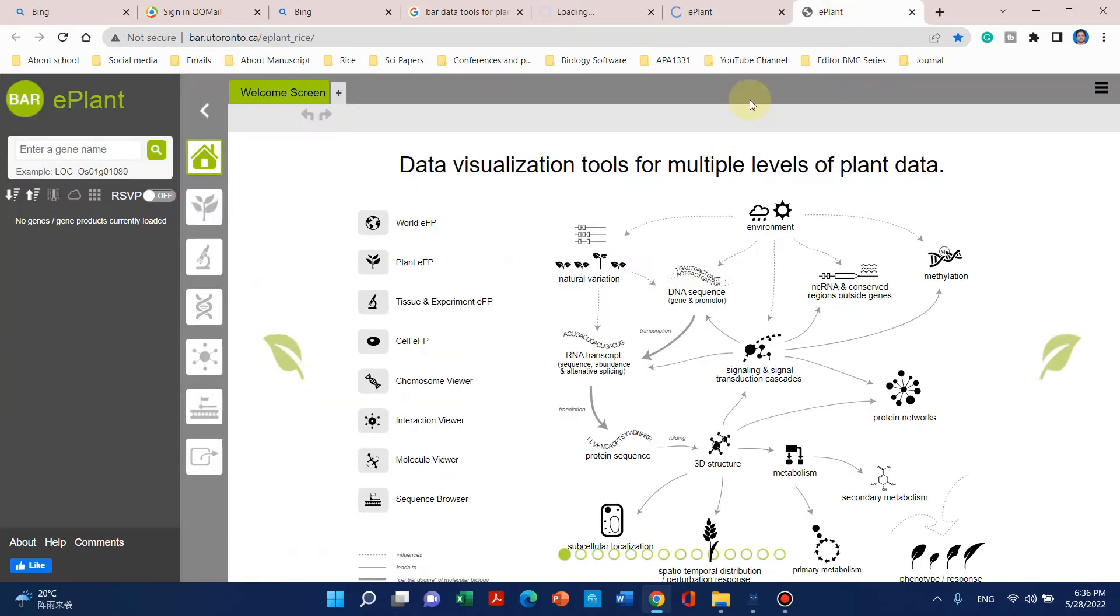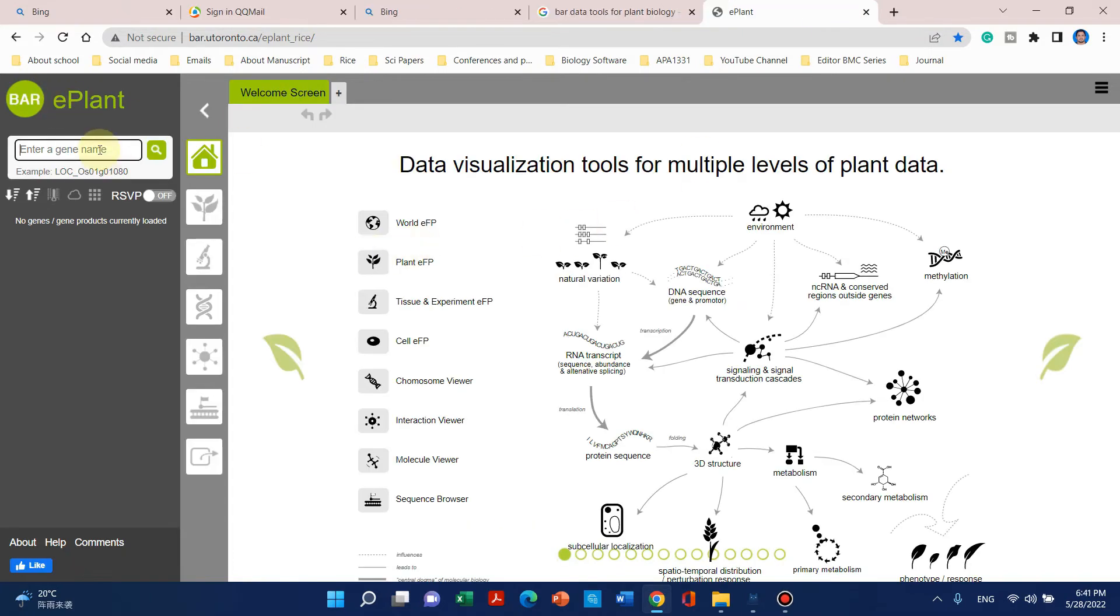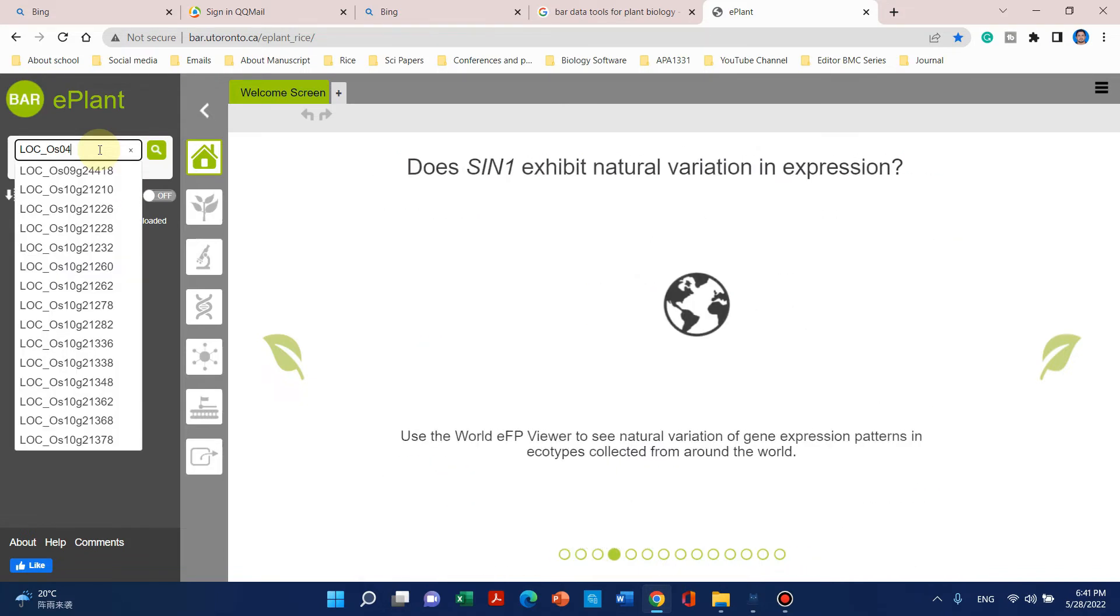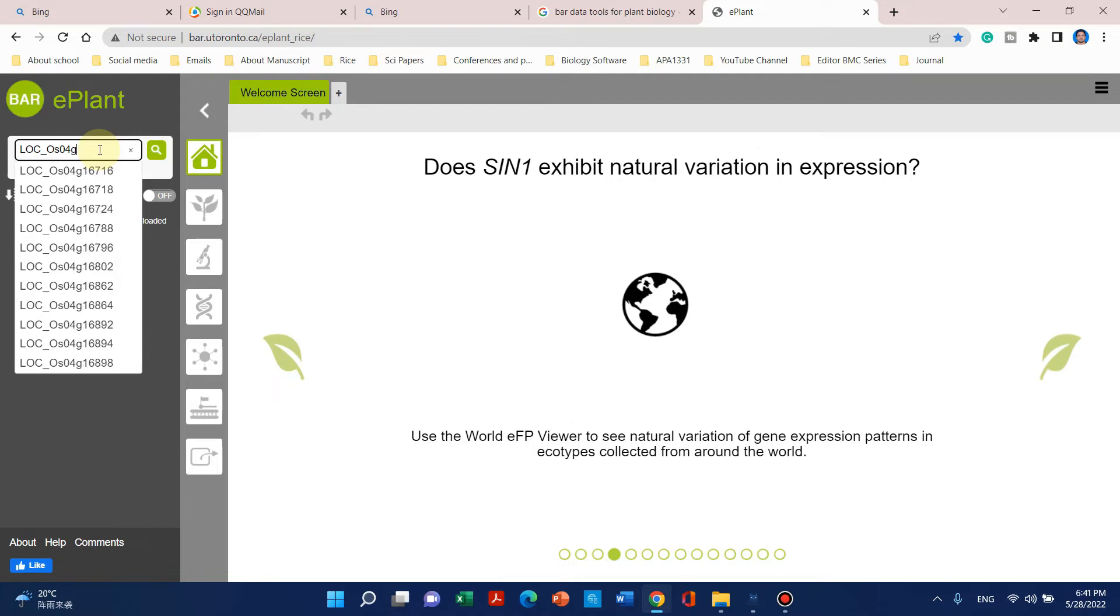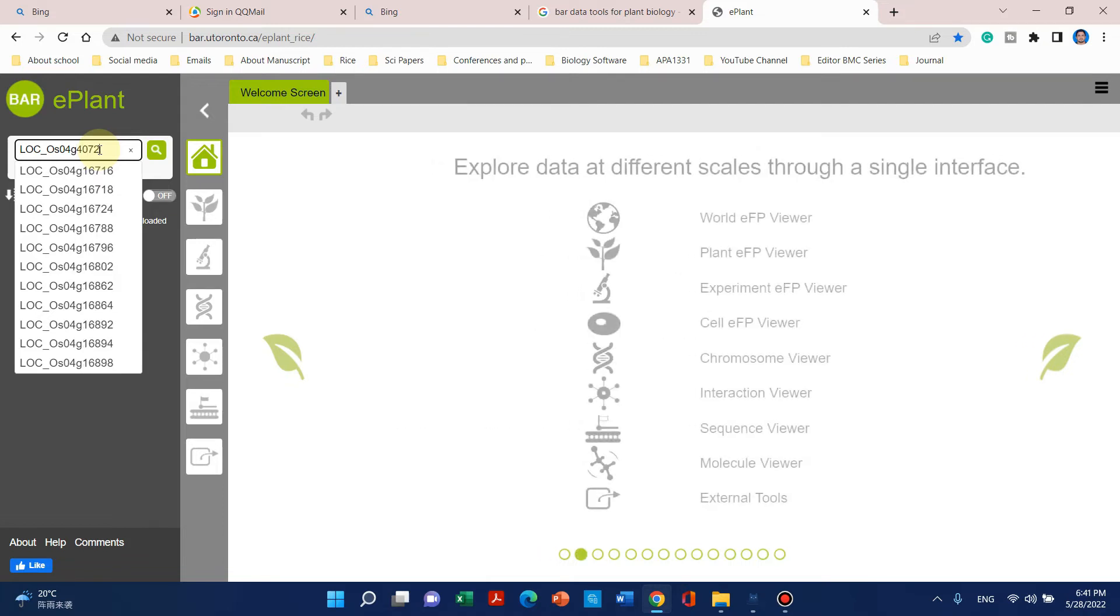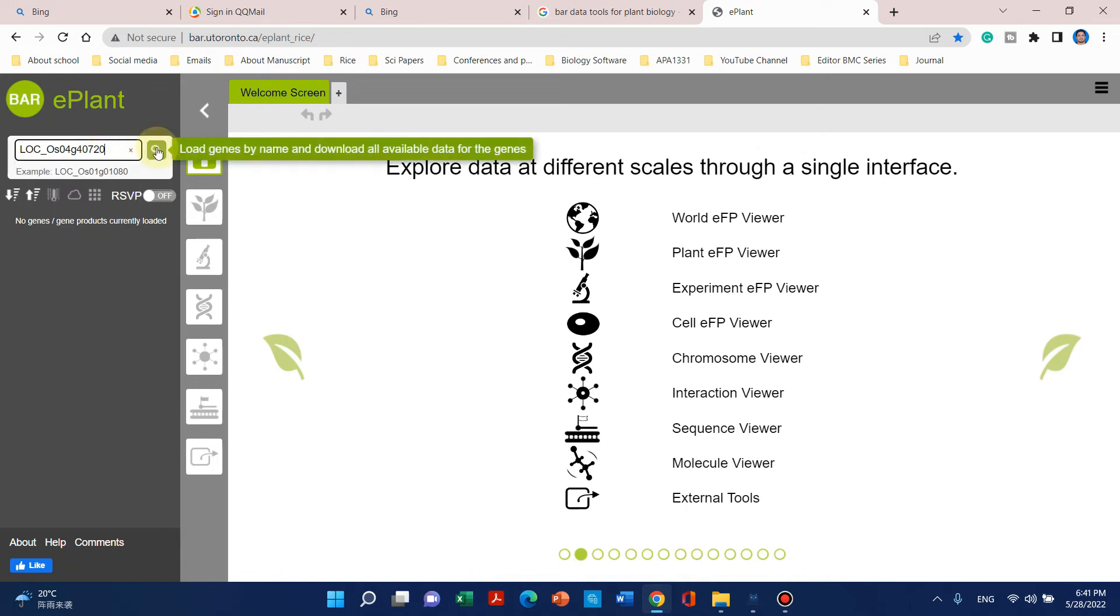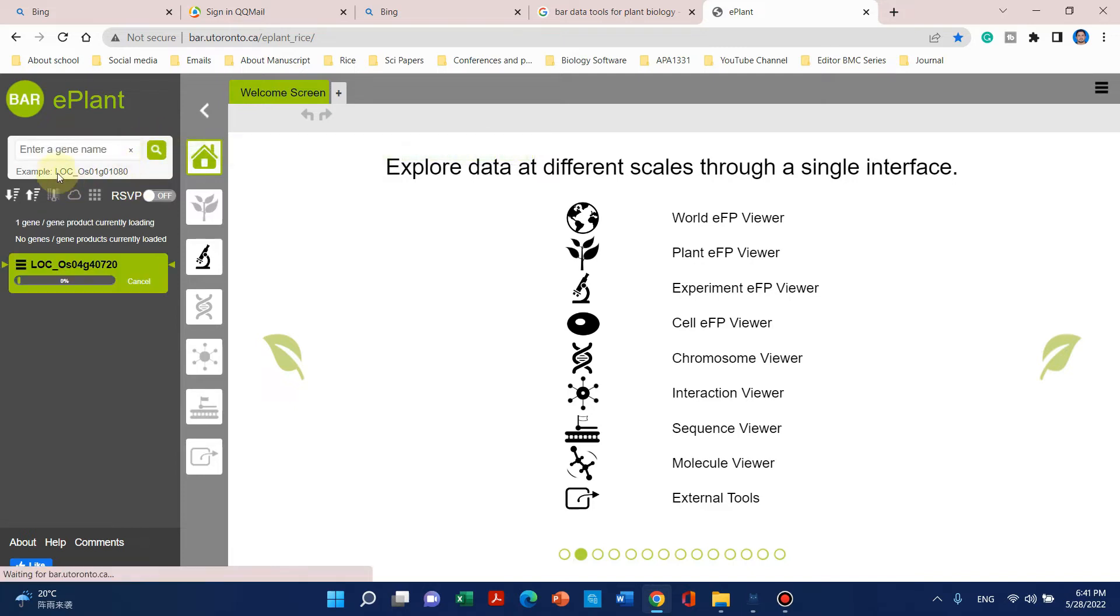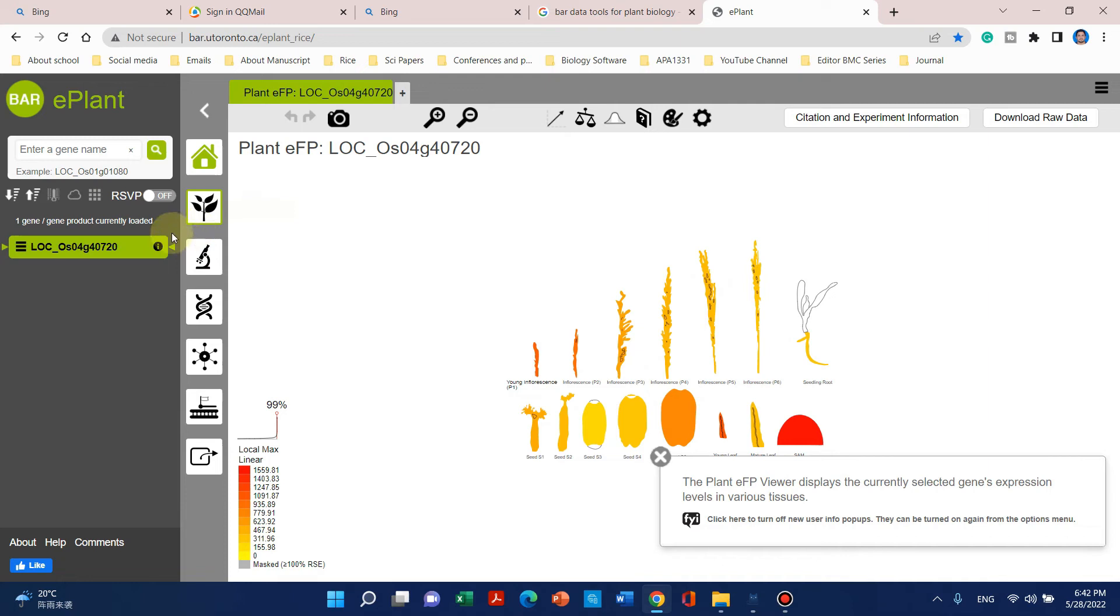That tab is the BAR ePlant browser of rice. Now here we can enter our gene of interest ID and locus. Let's suppose LOC_Os04g40720—this is our gene. I have cloned this gene, so let's try to get its expression by clicking on this. When you click, a bar will start to run and retrieve its expression profile.